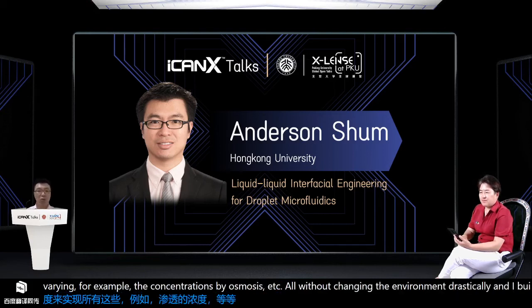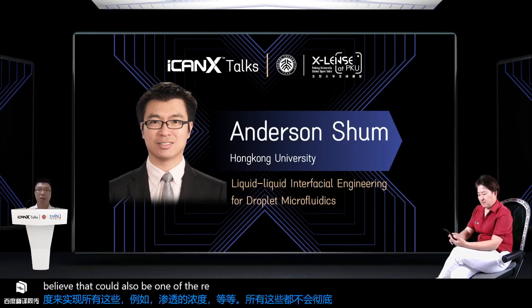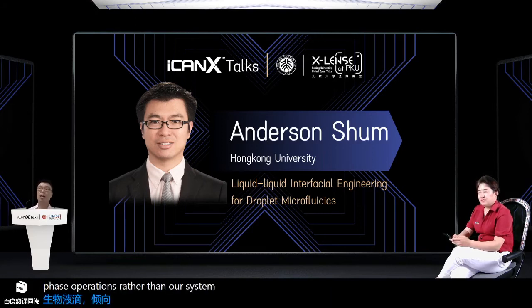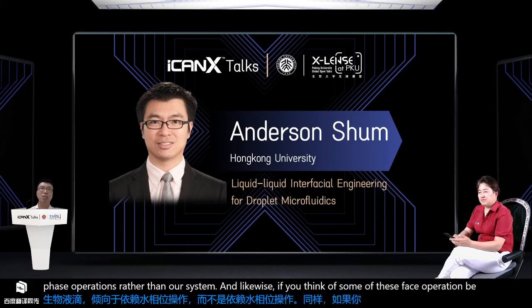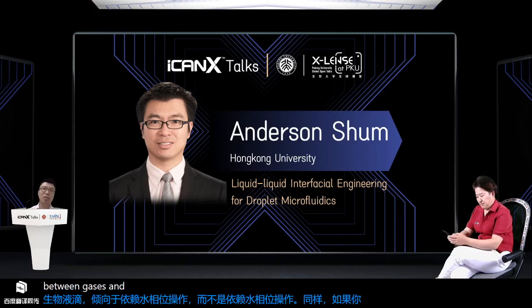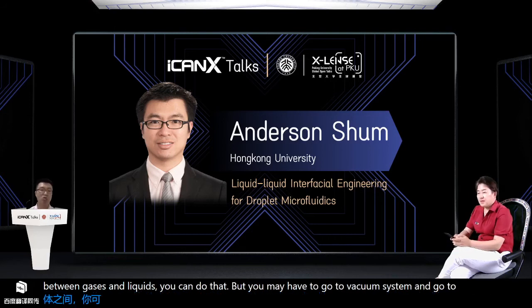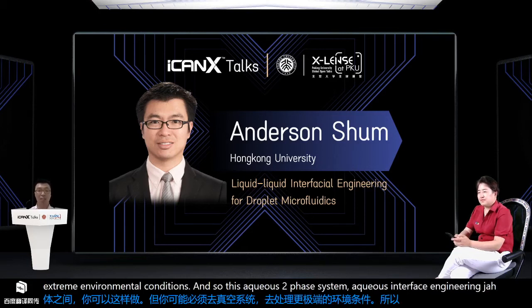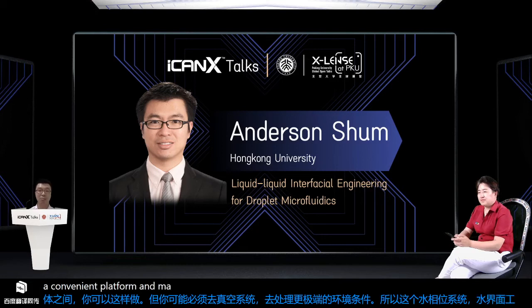And I believe that could also be one of the reasons why biological droplets tend to rely on aqueous phase separations rather than other systems. Likewise, for phase separation between gases and liquids, you can do that, but you may have to go to a vacuum system and more extreme environmental conditions. So this aqueous two-phase system, aqueous-aqueous interface engineering, just provides a convenient platform and model for us to study many of these very intriguing phenomena.